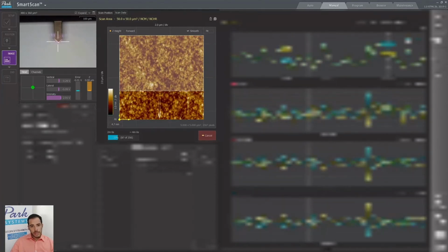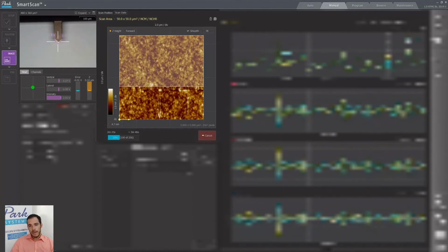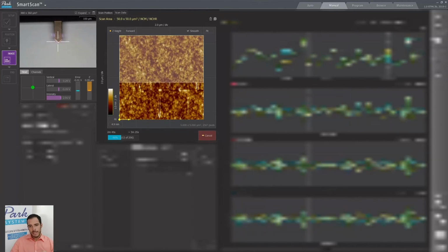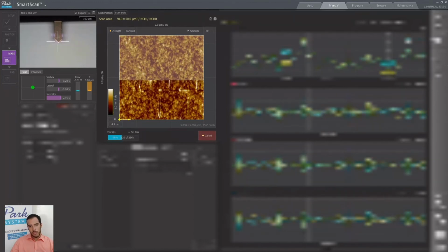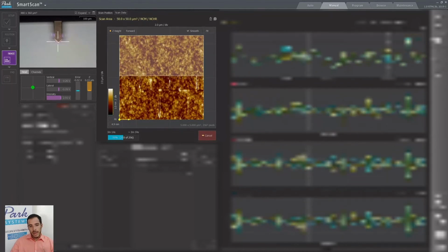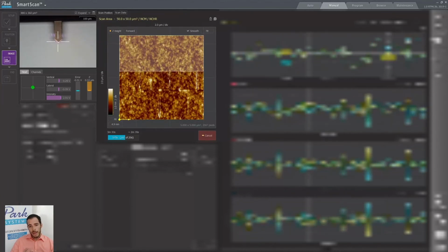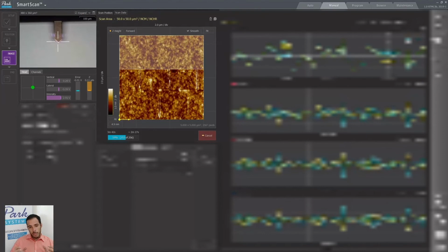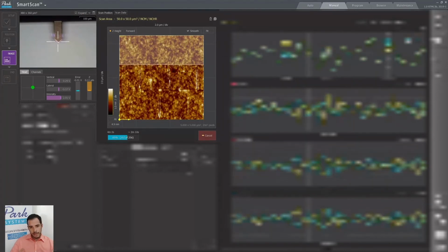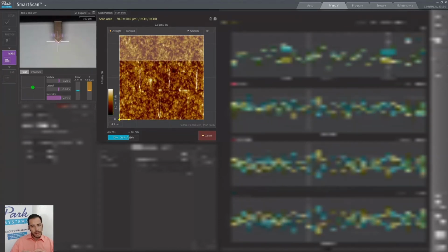Right now, we should start seeing the squares. If we look at the topography channel and the signal, we insert the cursors, but they are not landed exactly on the grooves we created. But we can actually see the grooves that were created, because we can also see an increase in the topography. Whenever we created a groove, the film around it got accumulated and created a bigger difference in topography around these grooves. And we can clearly see the squares.